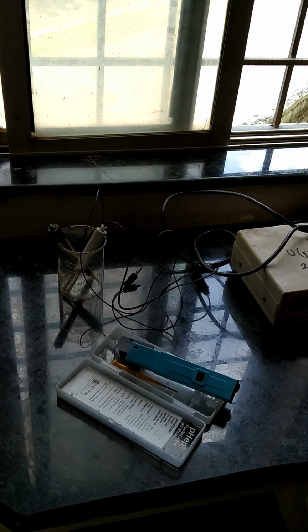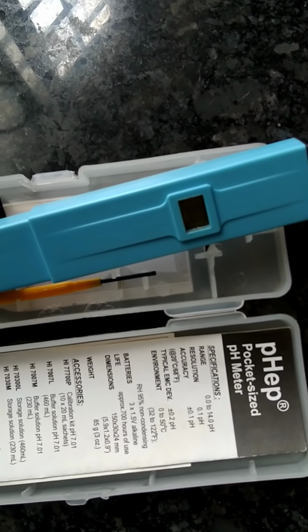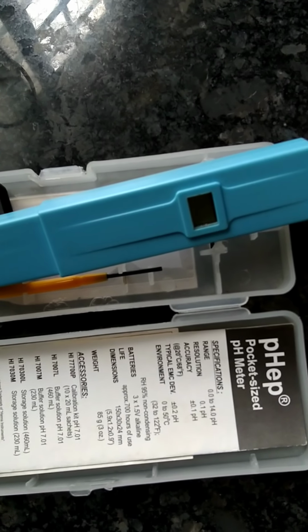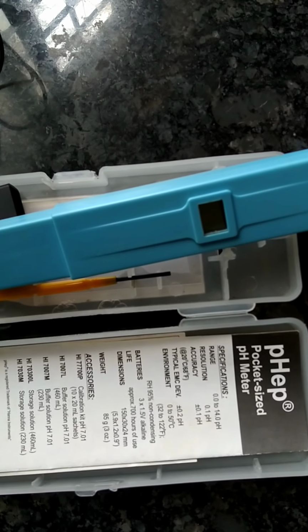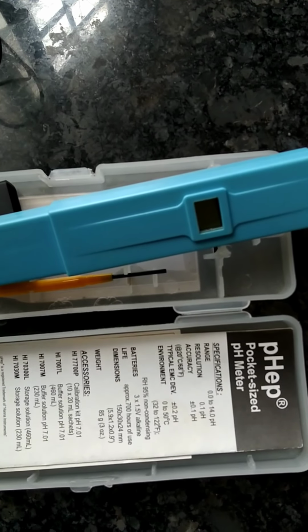So here we can see that it is a pen pH meter. You know that pH is a very important aspect for a salt when dissolved in a solution, and especially inorganic compounds are the salts which are used as the medium, as the catalyst, as the solvents for various types of chemical analysis, detection and determination, or qualitative and quantitative analysis.